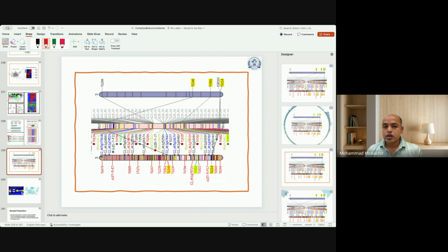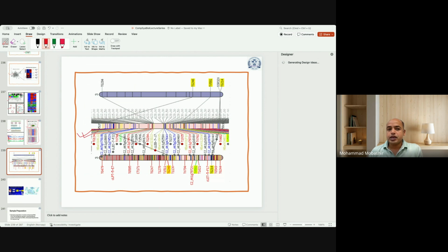Another way of presentation, if somebody is looking for direct mapping of the changes on the genomes, on the chromosome, is a really advanced way of annotated pictorial analysis, and this could be one of the finest ways of analysis. There are inbuilt tools or functions available in most of the coding platforms, which could easily plot the chromosomal mapping and these changes with proper annotation. There is no need to go for manual annotations.